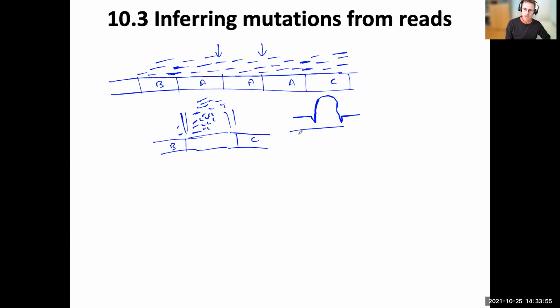And that would indicate that there's something going on in this particular gene region that needs to be evaluated more carefully. And that can mean that there's an insertion in the sample. And you'll note that we've sometimes referred to these as indels because if we have a deletion or insertion, it depends on directionality. A deletion in the sample compared to the reference means that there's an insertion in the reference compared to the sample, vice versa. If there's an insertion in the sample, that means there's a deletion in the genome.